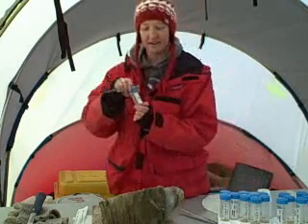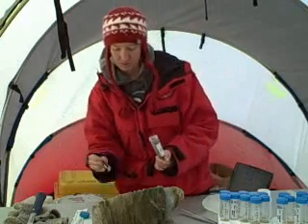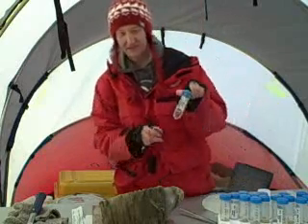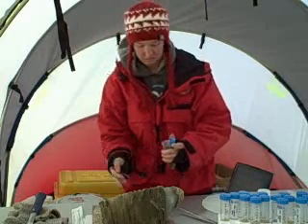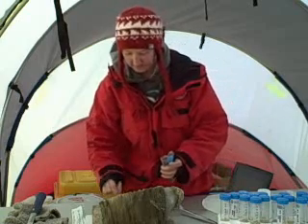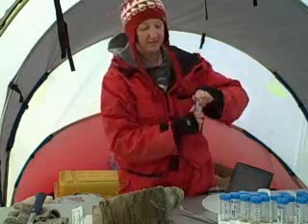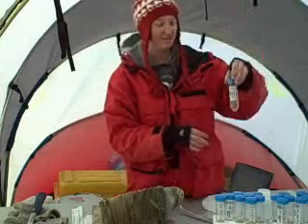And the first one I'm going to add is dirty ice that's going to go into the cold environment. So this is tube number 2. Not very aseptic techniques. The second one is dirty ice that's going to go into a warm environment. So this is not very aseptic. So now we have both of our dirties done. So we'll let them sit in there overnight.